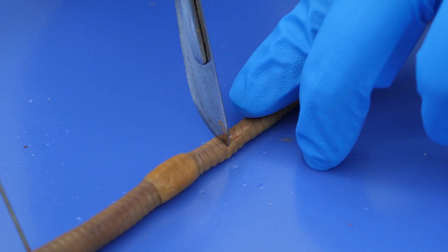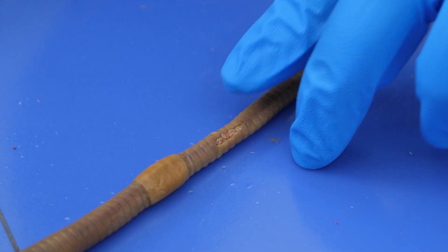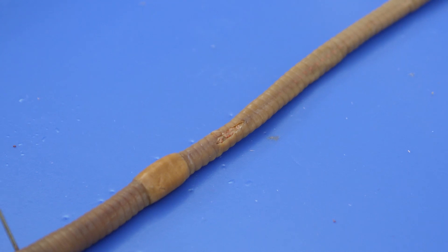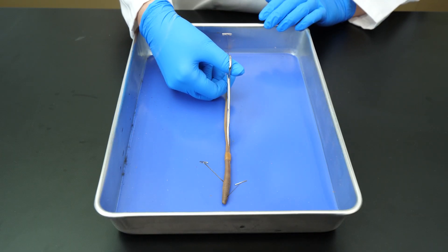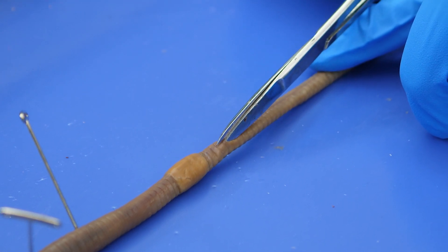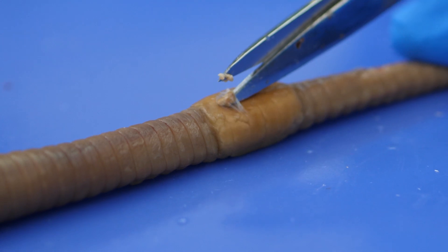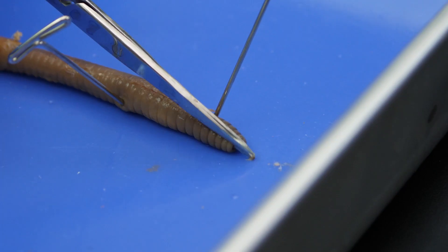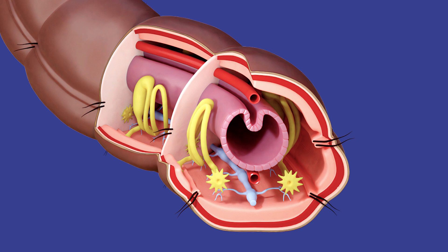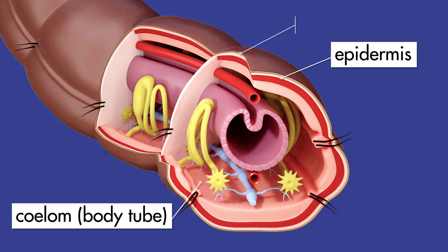We use the scalpel to make a short transverse incision in the dorsal surface, just behind the clitellum. Next, we use the scissors to make a medial incision to the anterior end. To prevent damage to internal organs, we want to cut through the epidermis and cuticle without cutting too deeply. Most of the earthworm's organs are contained in a hollow body tube called a coelom, which is surrounded by a thin epidermis and cuticle.